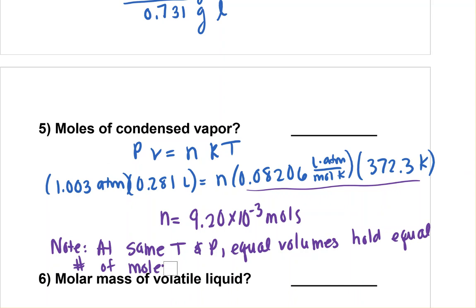Let me change that word. Let's make that molecules. Okay, I'll grab that in a second. Let's put this number up here.